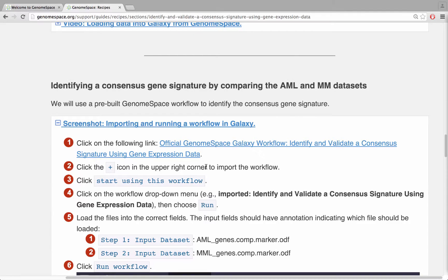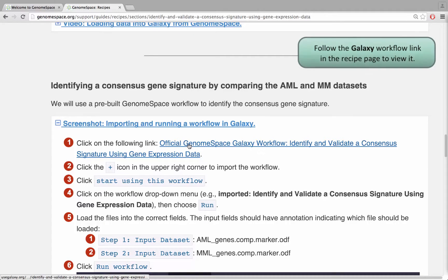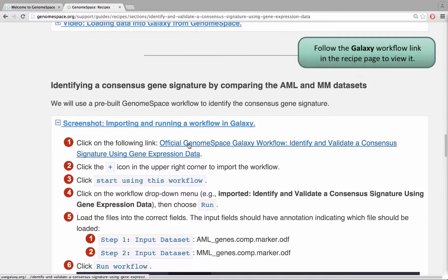In this video step, we will import and run a Galaxy workflow. Our GenomeSpace recipe pages contain links to relevant Galaxy workflows. Click on a workflow link to view it.